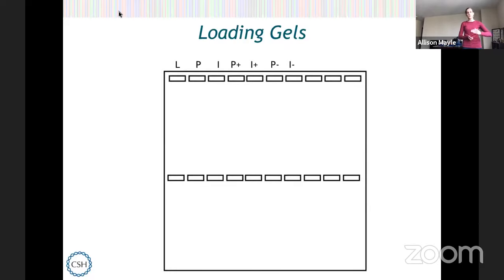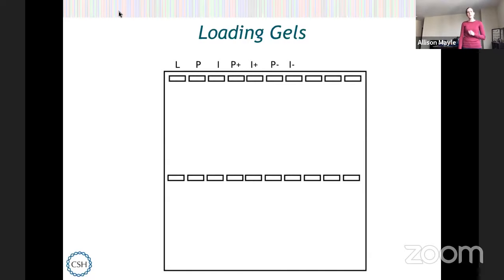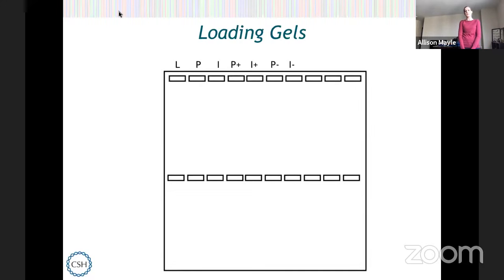So the ladder tells us: if your DNA was 100 base pairs long, it would move this far with the 100 base pair band. I've labeled this gel picture with P for plant and I for invertebrate — those are the samples I just set up here. I also put P-plus, I-plus, P-minus, and I-minus. Something else we want to include when we do a scientific experiment are controls. The pluses are positive controls — DNA you know works for this type of PCR, so you can make sure if your PCR doesn't work for your new sample, it wasn't a problem with the polymerase or primers.